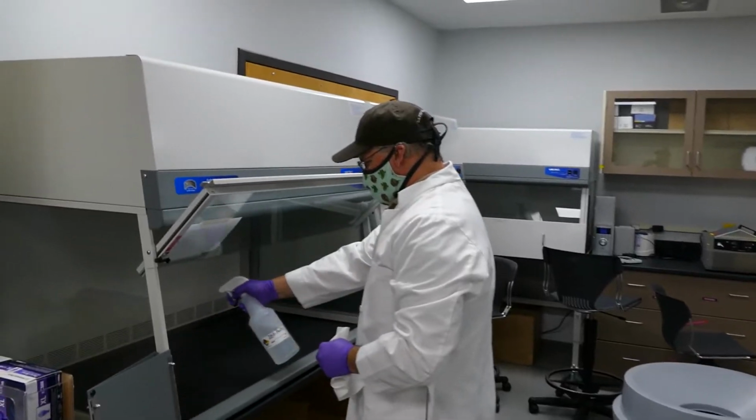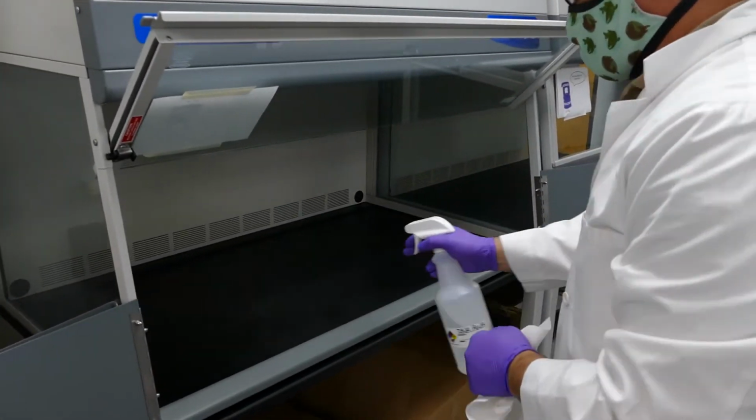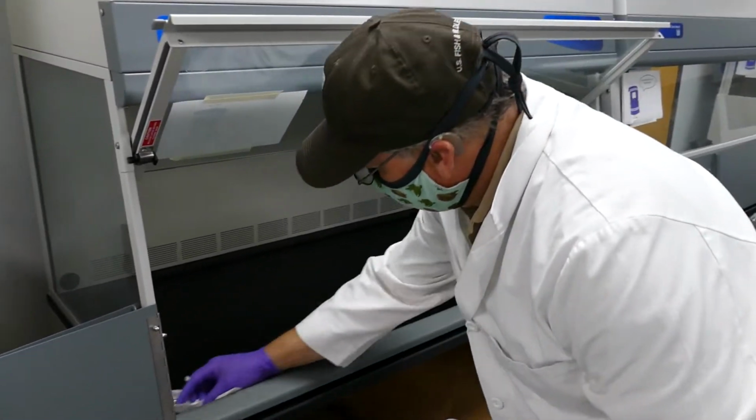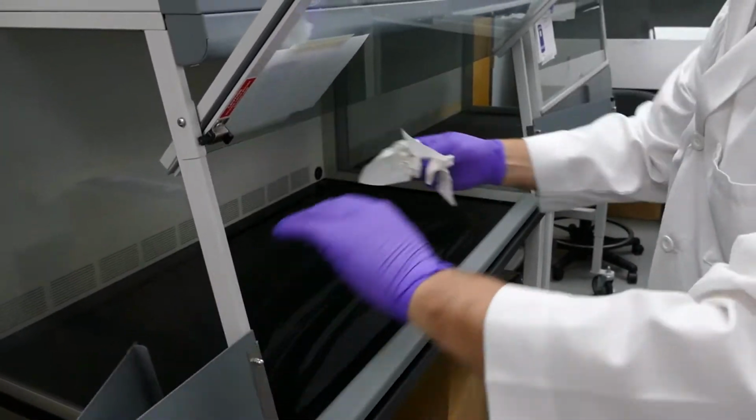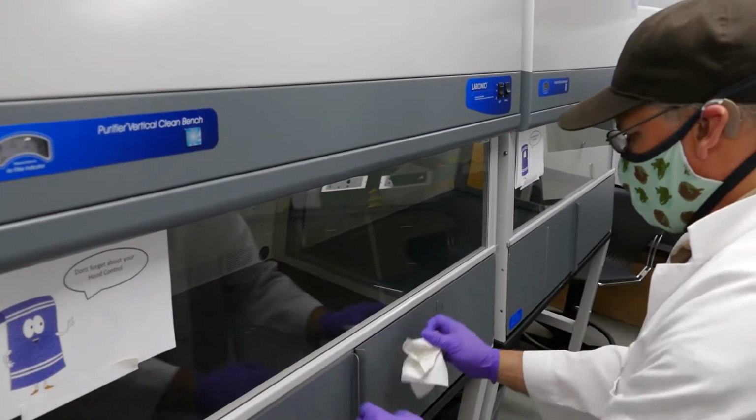Spray the emptied interior of the laminar flow hood with DNA Away and wipe clean the interior and all touch surfaces. Then close the doors, turn the blower off, and turn the light switch to UV for 10 minutes.